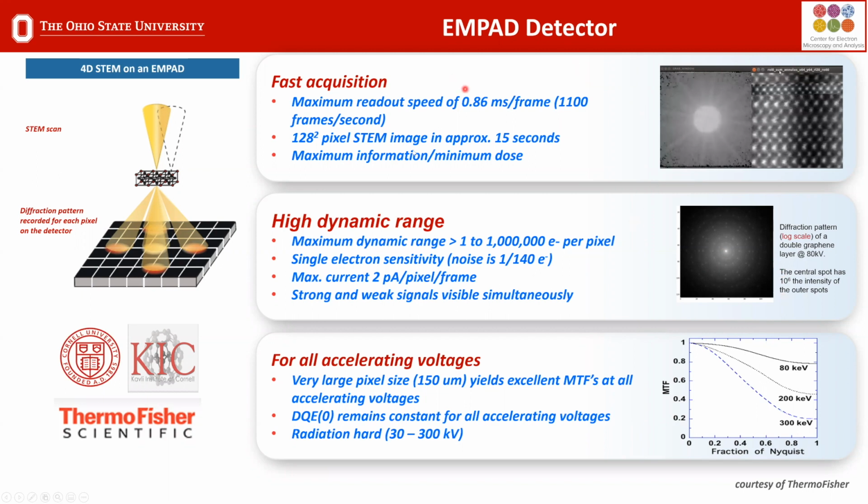When we look at the acquisition speed of it, I hope you can see the movie playing up here. This is a real acquisition. So the image is scanning up. Here we have a diffraction pattern. In the middle of it, you can actually see the ronchogram and the various phases going on in the middle of this disk. Again, showing the dynamic range, and there are virtual apertures put on here that can be changed over here and show different images with different information.